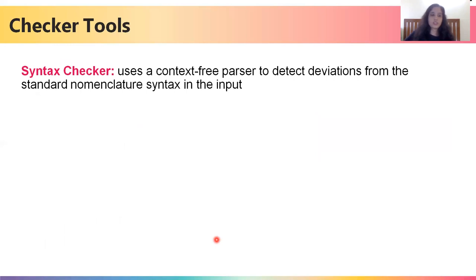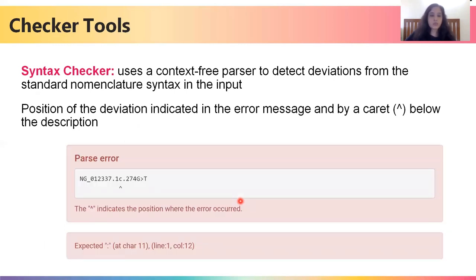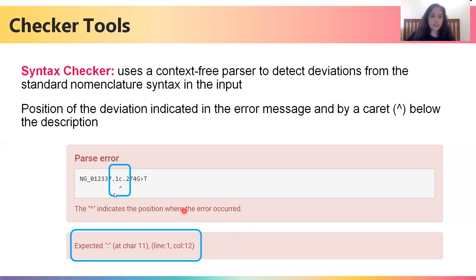The next checker tool is the syntax checker. If you are new to HGVS notations, you can use this tool and it will tell you whether the syntax is accurate. In case of an error, it will highlight where the error is using a caret symbol and the line below will tell you what the error is — making it extremely simple for you to correct your nomenclature.